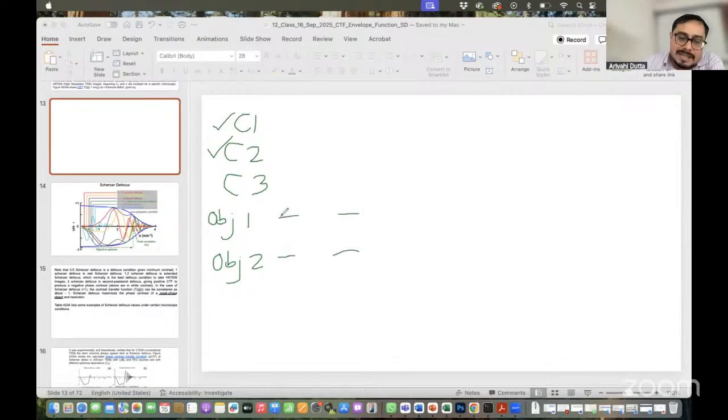Now, here these two lenses are interconnected, and how it is coming, if we just start from the beginning: okay, the gun crossover point is there. That is the D0 I talked about multiple times. So first the beam is coming like that. This is your C1 lens current. Then the C1 lens current converges the beam somewhere here. So now this is your C1 lens. When you are considering the C1 lens, this is your spot size we are considering.